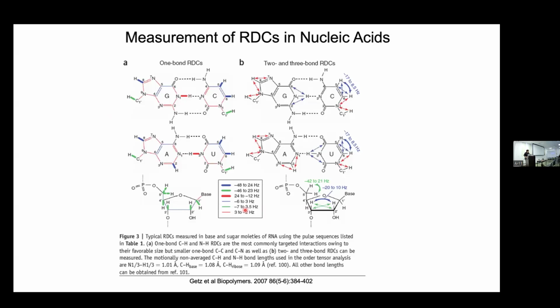there's a preference for, like in any experiment, what's the number that you want to maximize? So if I tell you, you have 7 options of RDCs to measure, which number would you like to have? This could be true for any experiment. They're all valuable. Every vector is wonderful, any vector is wonderful in the molecule. So what determines the quality of the RDC I'm going to measure? What's the trade-off? What are two numbers that I care about?